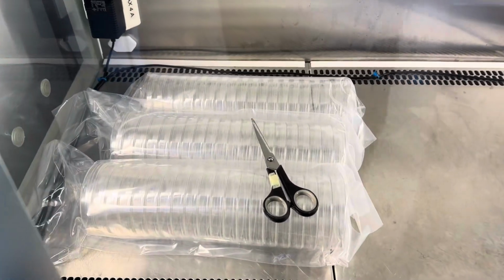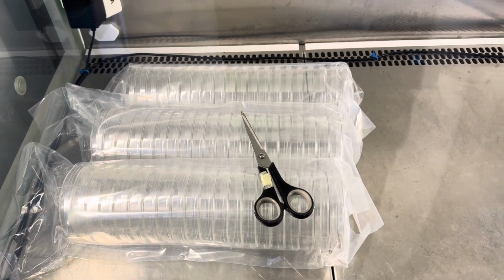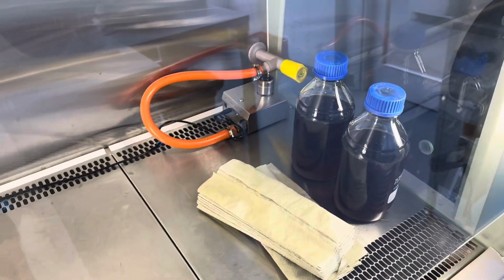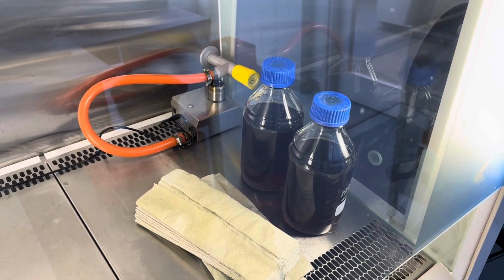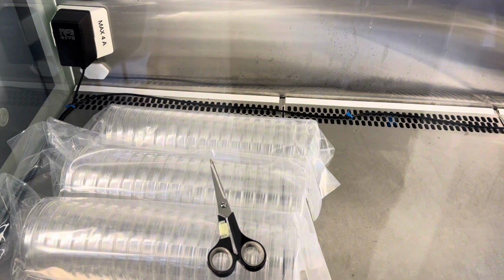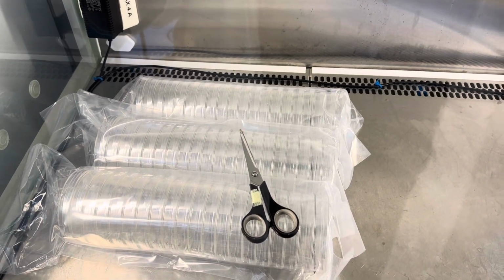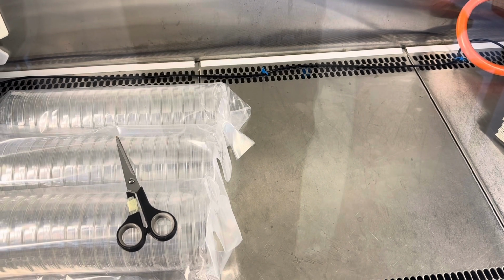Alright, so now the bottles have been sterilized in the autoclave, and I have put them in this hood, and these are the Petri dishes. Now I will cut the bags of these dishes, and then I will pour this malt extract agar media into these Petri dishes. I will show you the end result when I have filled all these dishes.